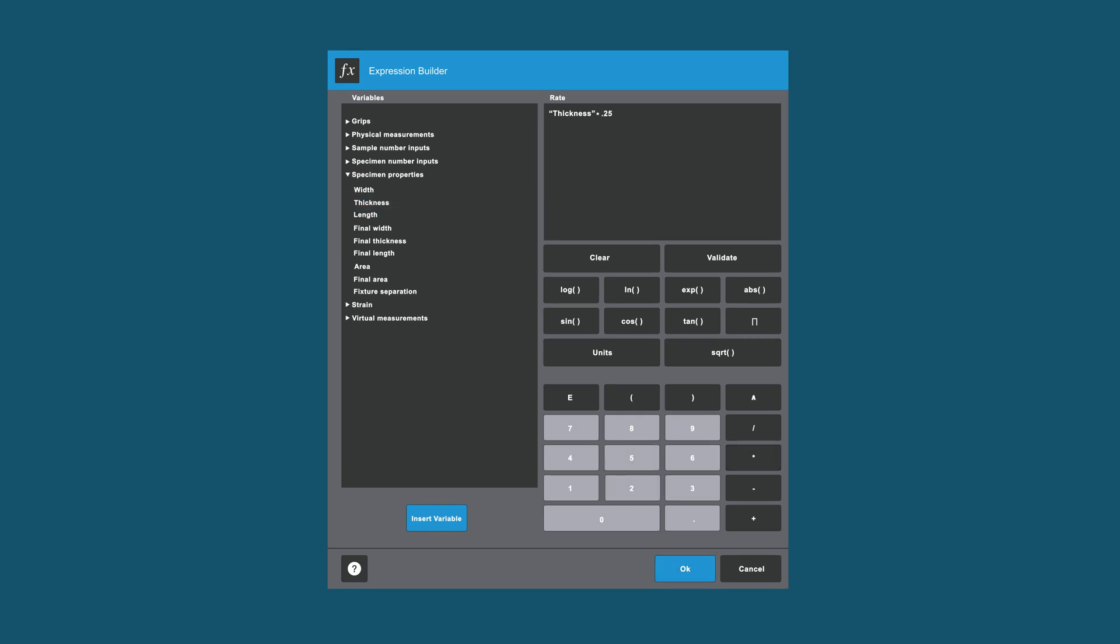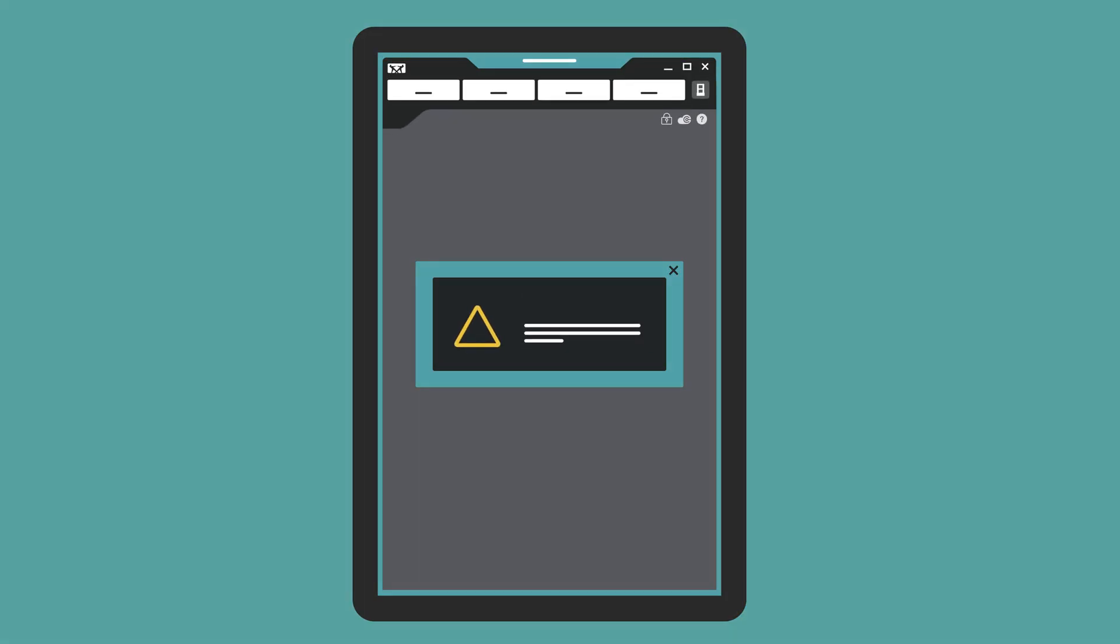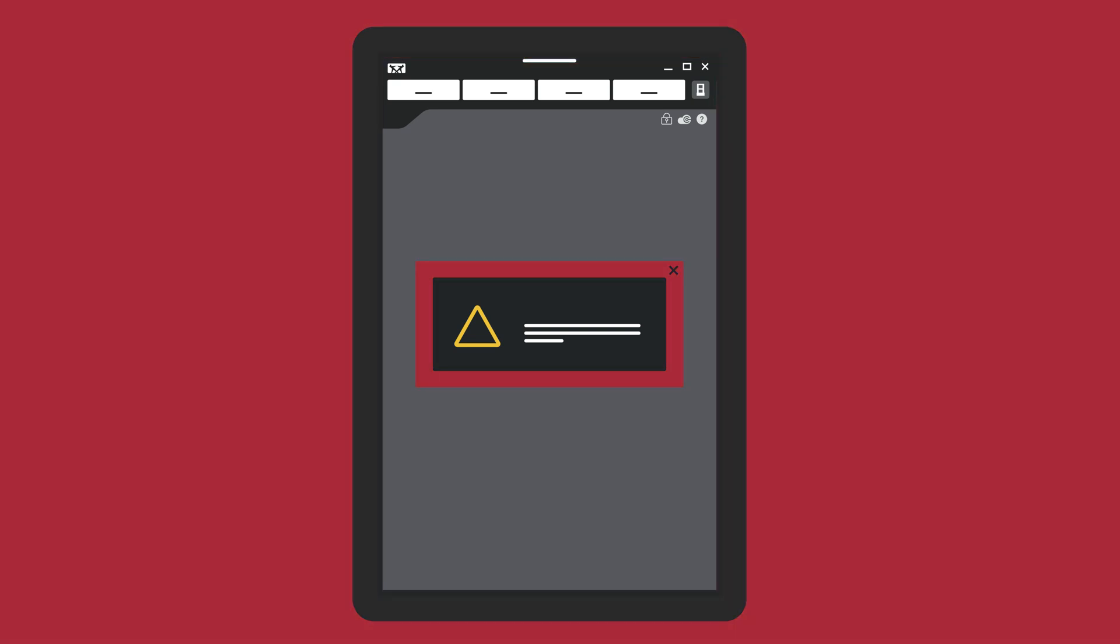A dynamic border and prompts visually communicate the status of the system, creating a safer environment for anyone using or approaching the test space.